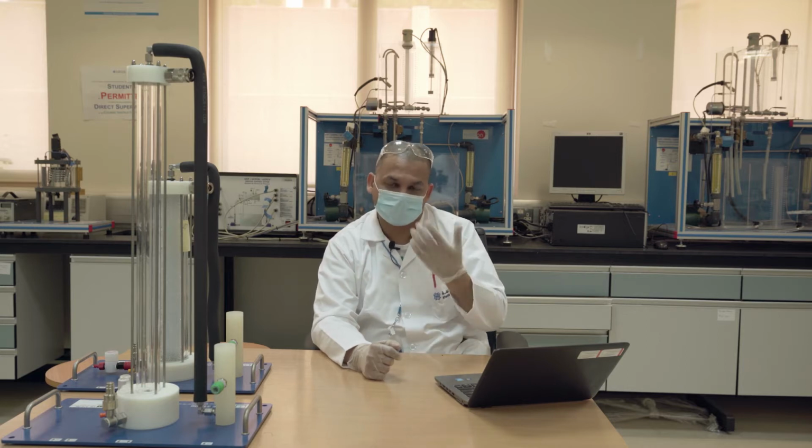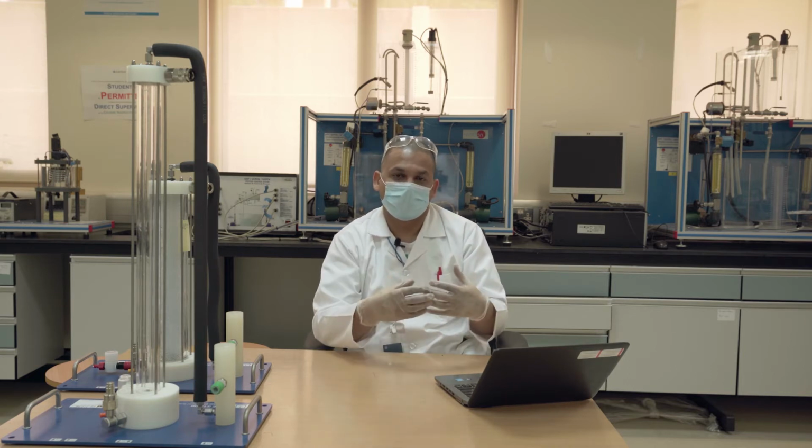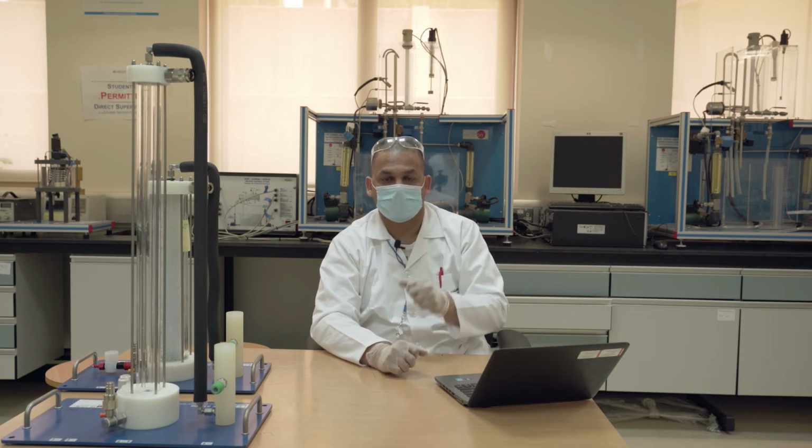So in the course, we want to do experiments for a particular system or reaction, which in our course is saponification. We are going to react ethyl acetate with NaOH to form sodium acetate and ethanol. What we need to find out is the kinetics. That means the order with respect to ethyl acetate, the order with respect to NaOH, the activation energy and the rate constant. The four parameters I am looking for.